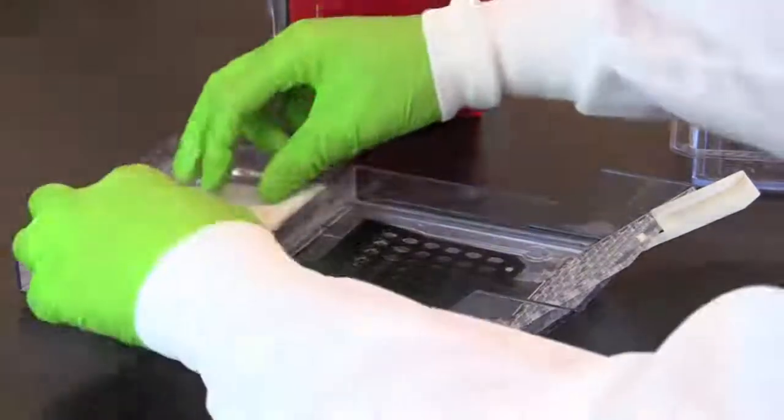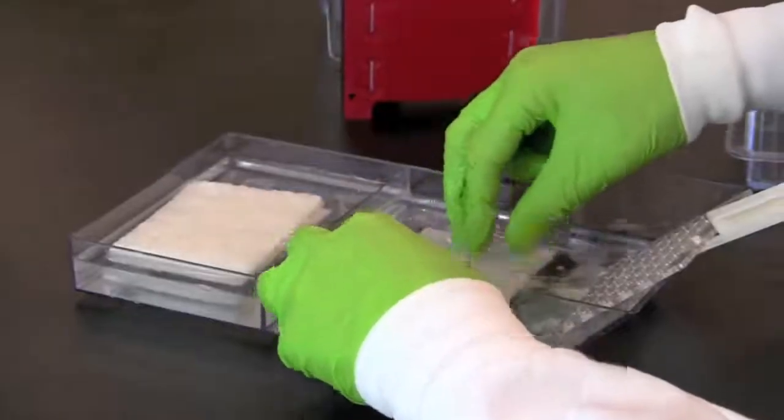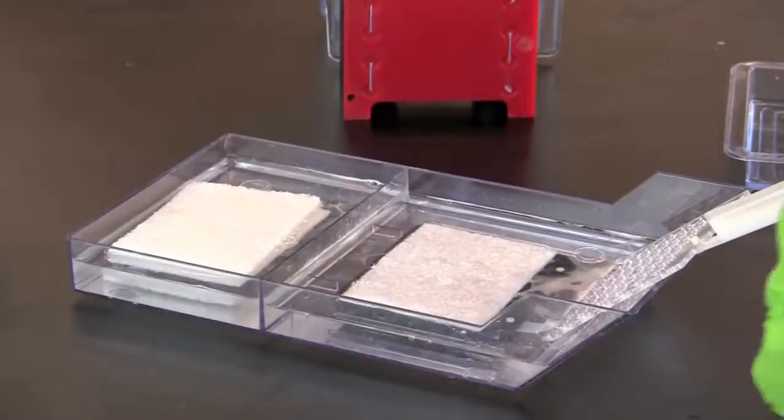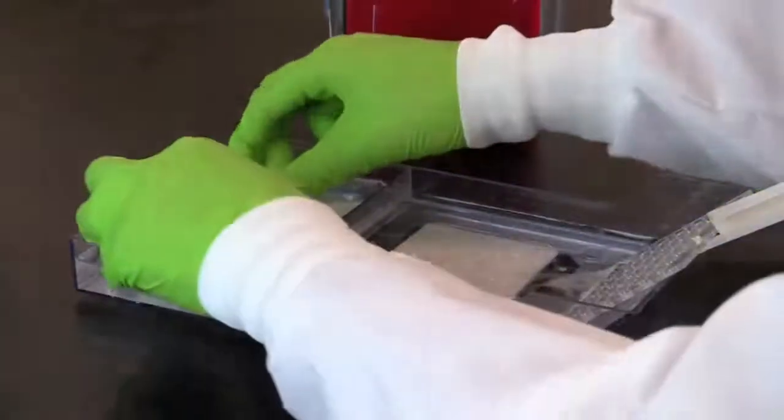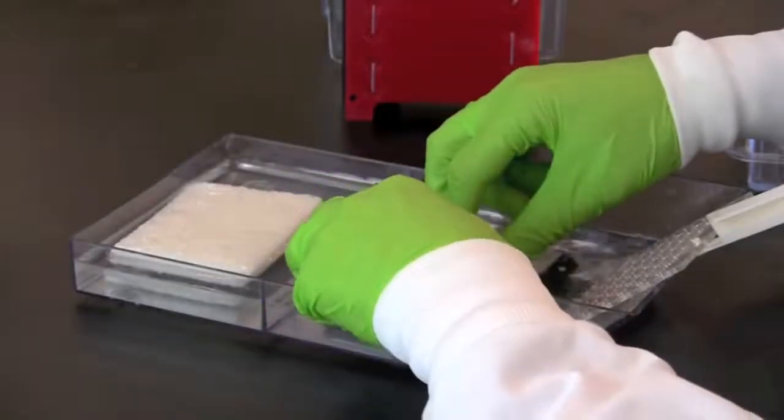Lay one fiber pad flat on the black plastic. Next wet a piece of blotting paper and place it on top of the pad. Be careful to avoid any bubbles between the pad and the paper and make certain the buffer covers the paper.